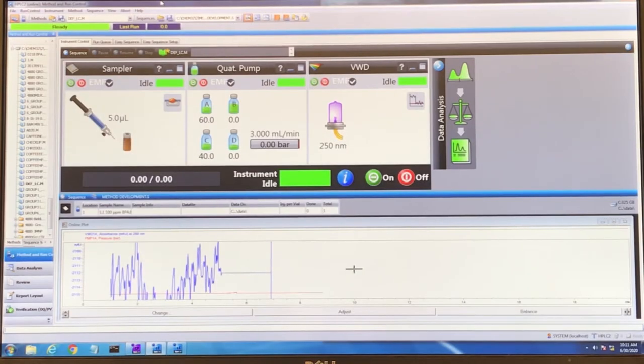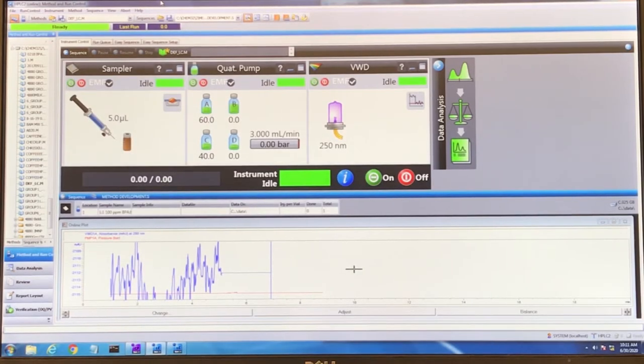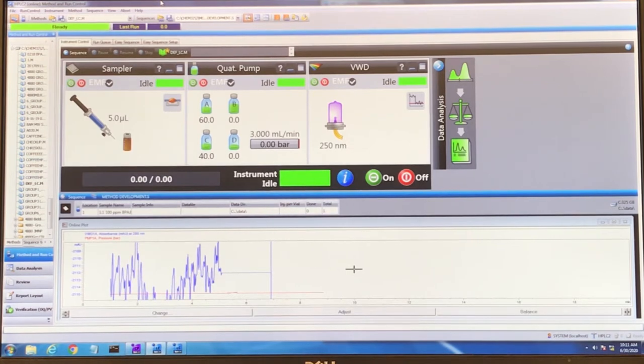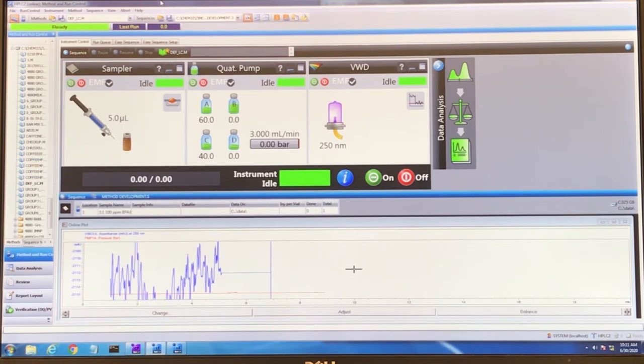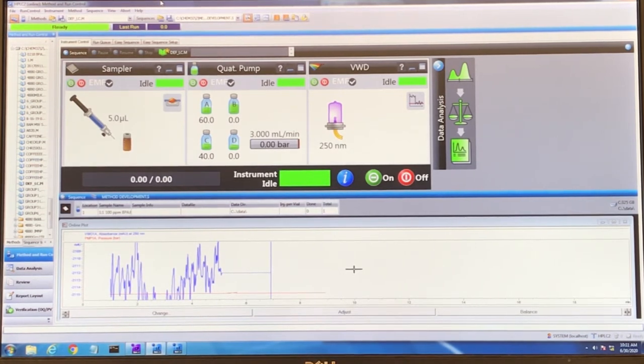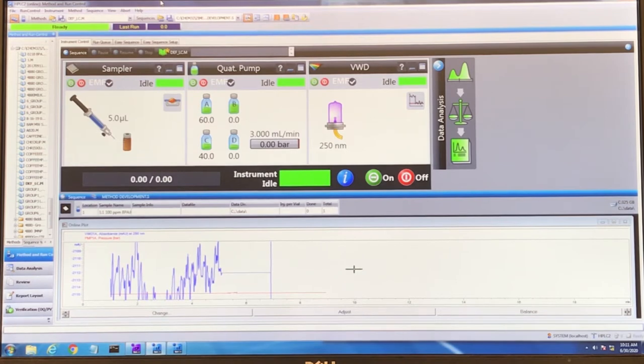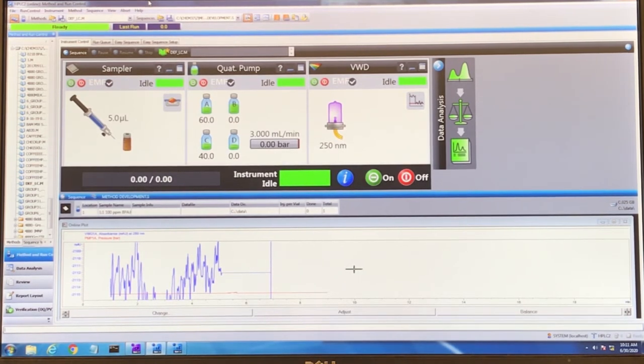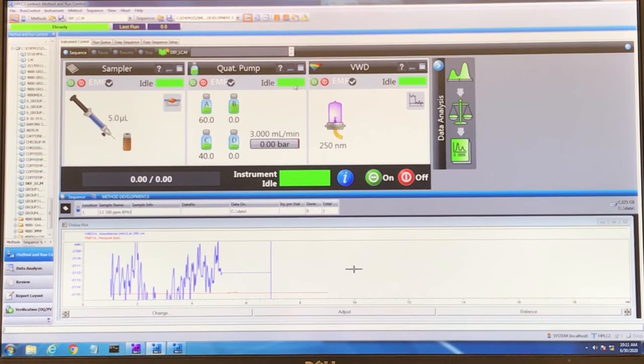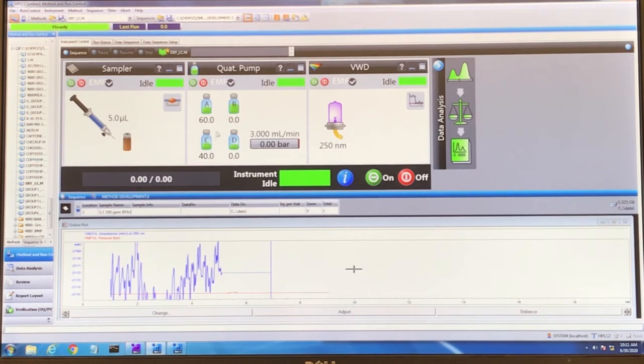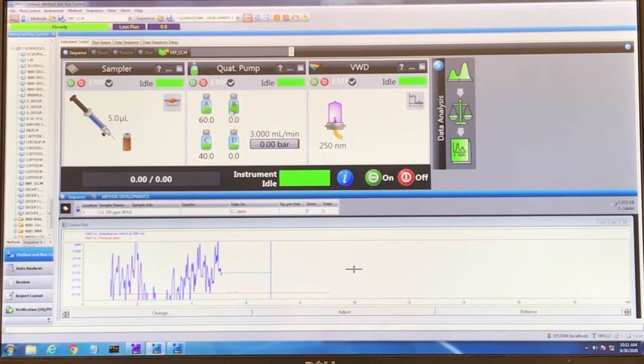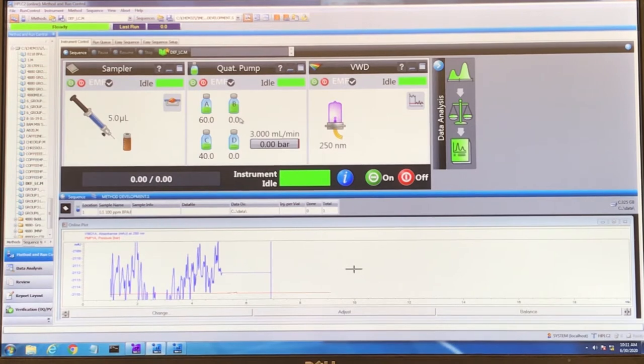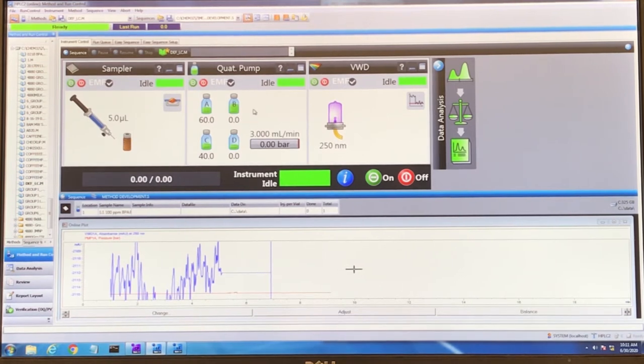While you're purging the LC system, it's a good idea to make sure that the solvents being used to purge are the ones that you're going to actually use during your experiments. The ratios don't necessarily need to be perfect, but you want to make sure that the tubing from the solvent bottles you're going to use has been purged.